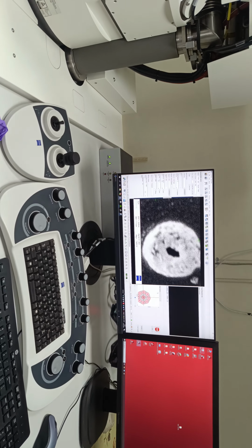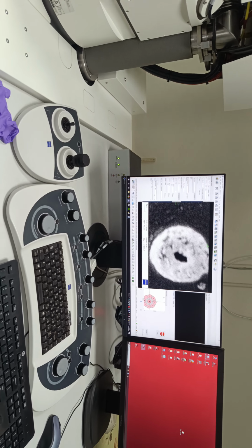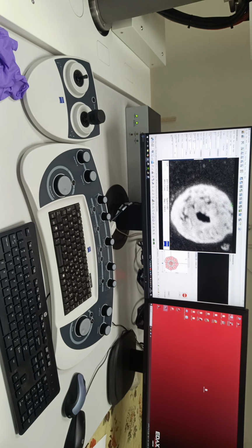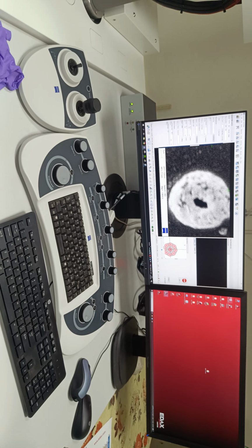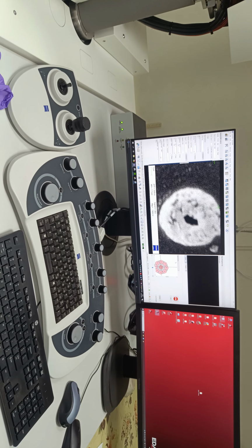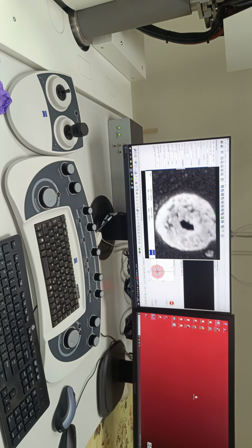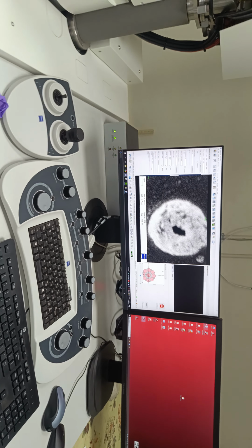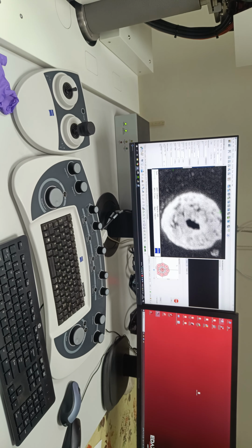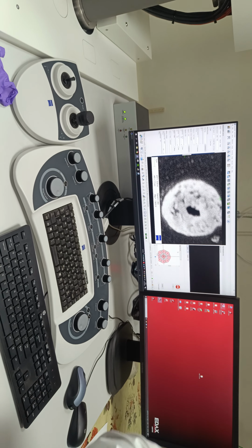We are controlling the current which passes through the coil, and the moment we change the current, we change the path and properties of the electron beam, how it behaves. The electron beam passing through this coil also changes its path and behavior. Can you visualize that physically?